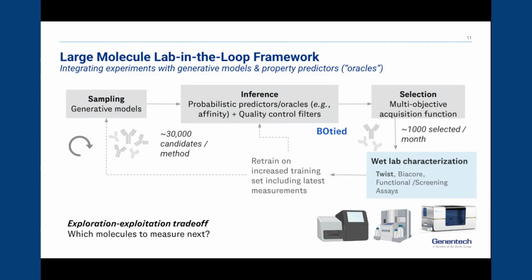So after we pass the selection and ranking, the variable region sequences are then synthesized as linear DNA fragments. And this is the job of Twist Biosciences, right? This kind of linear DNA fragment-based expression workflow trims multiple cloning steps, saving a lot of time and cost, while also being very amenable to automation.